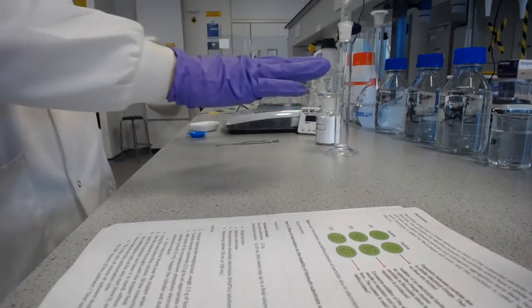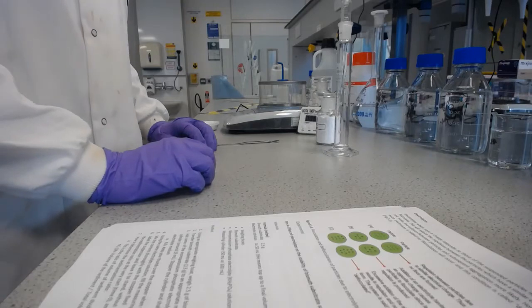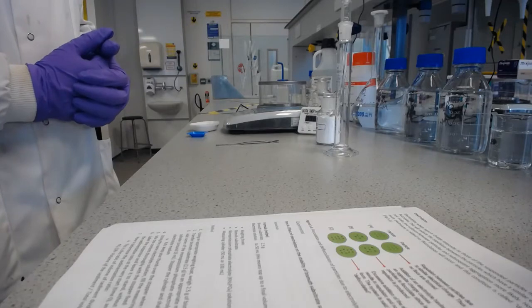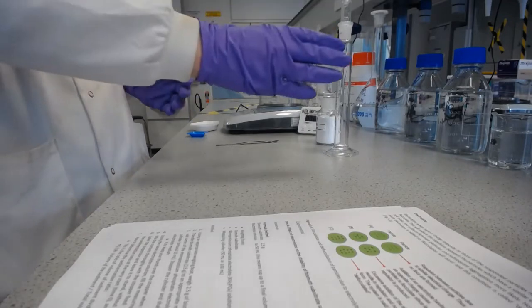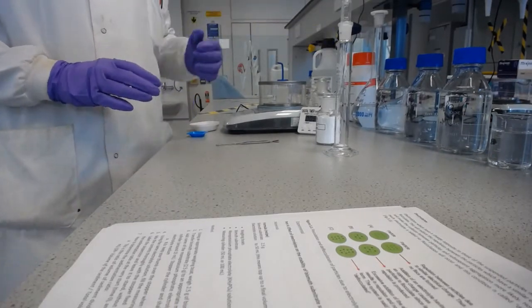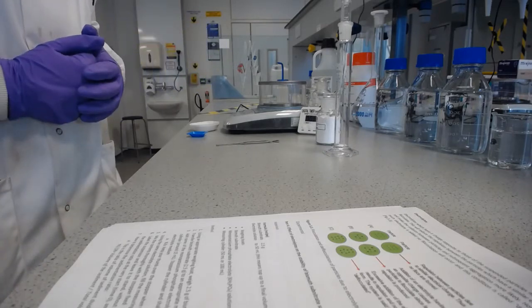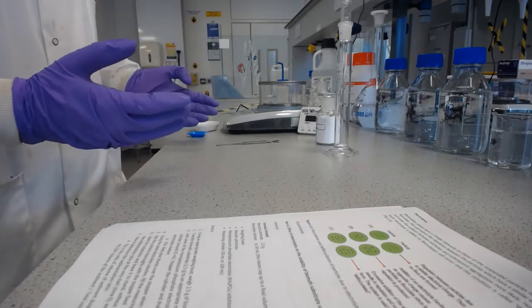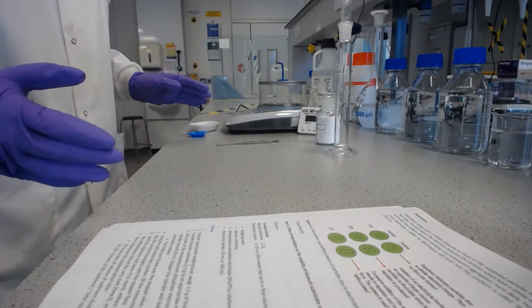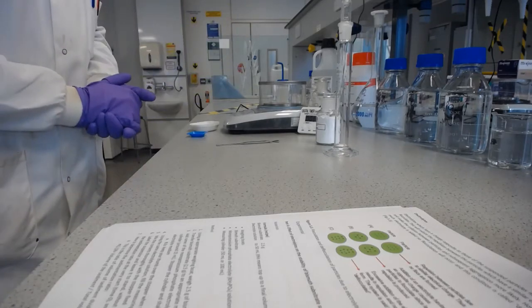And 5 different strengths of an electrolyte solution. So this is monopotassium phosphate electrolyte. So 1 potassium and phosphate, monopotassium phosphate, all the way from 0, which is really just deionized water, all the way up to 320 millimolar solution of potassium phosphate. And essentially all I'm going to do is weigh out 5 lots of bismuth at 2.5 grams, and make them up to 50 millilitres in the measuring cylinders.